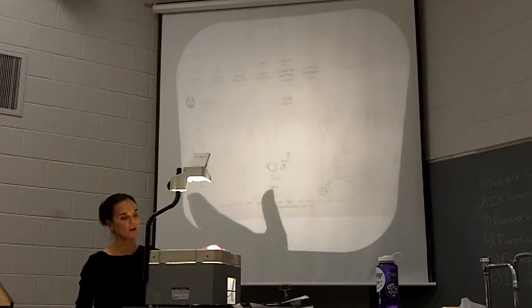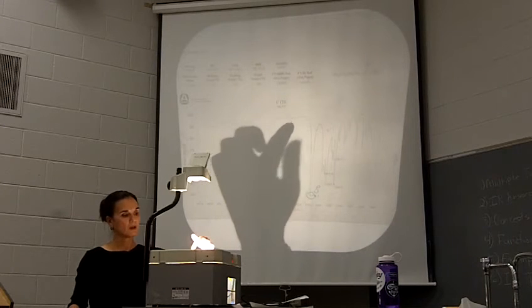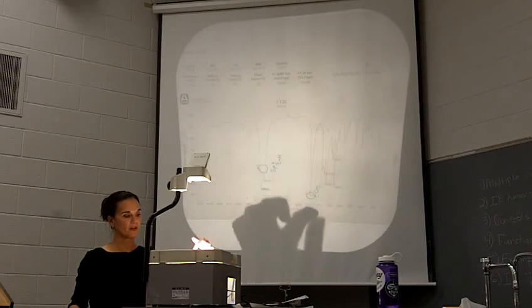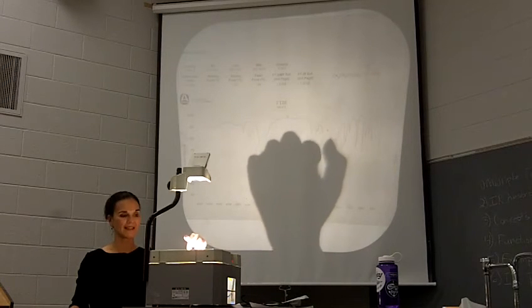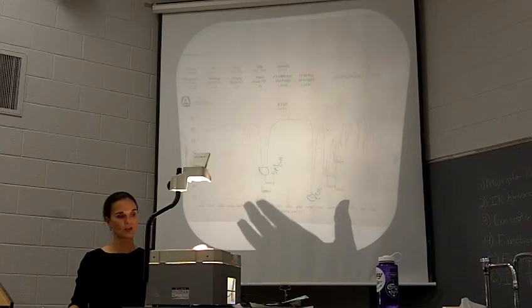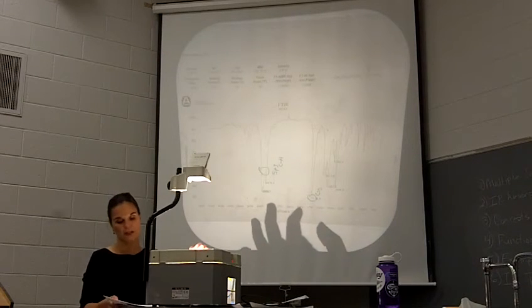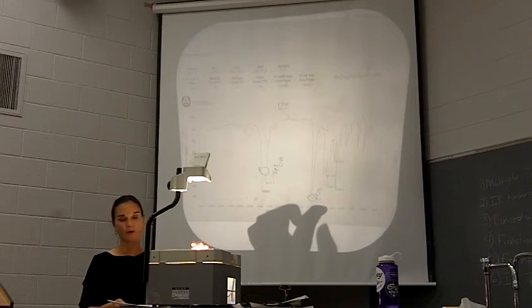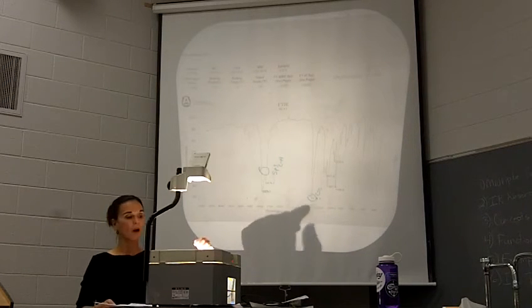Now with a ketone, really characteristic of a ketone, the C double bond C stretch was not as intense as this ketone stretch. A carbonyl stretch in an IR spectrum is very intense. So if you have a carbonyl present, it is going to be a very intense peak in your spectrum, okay?